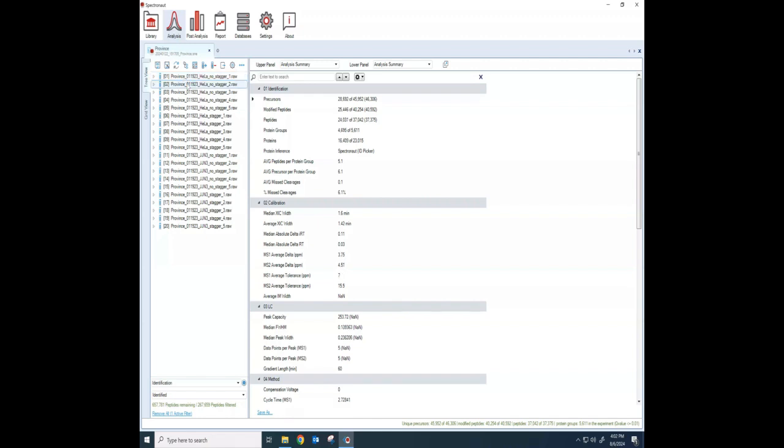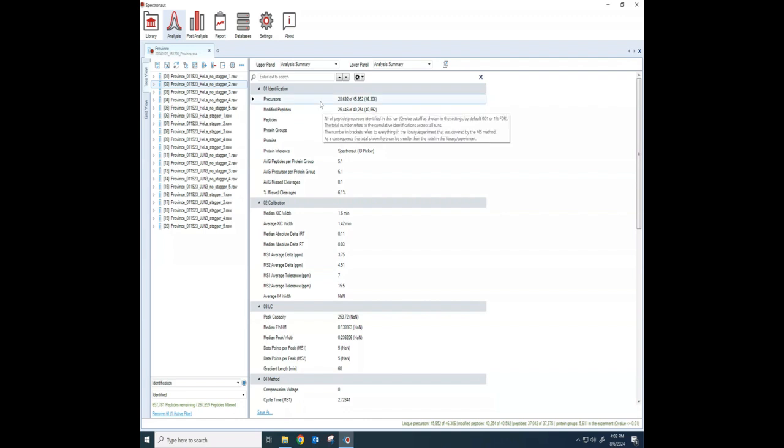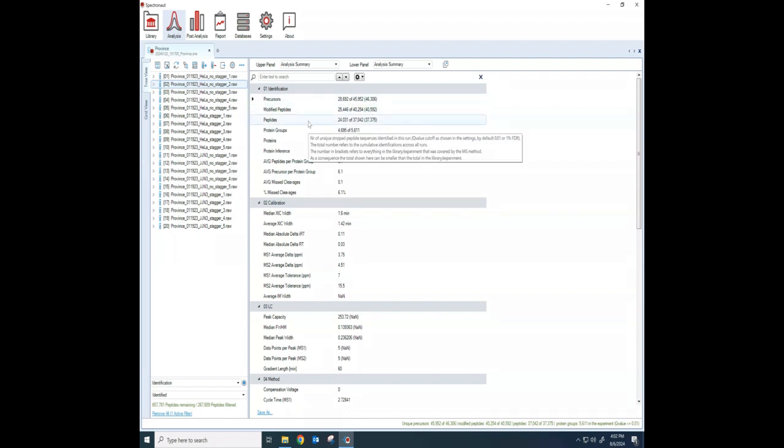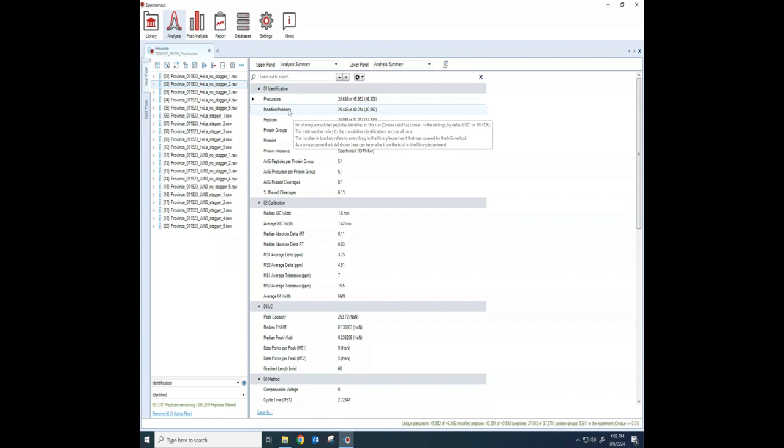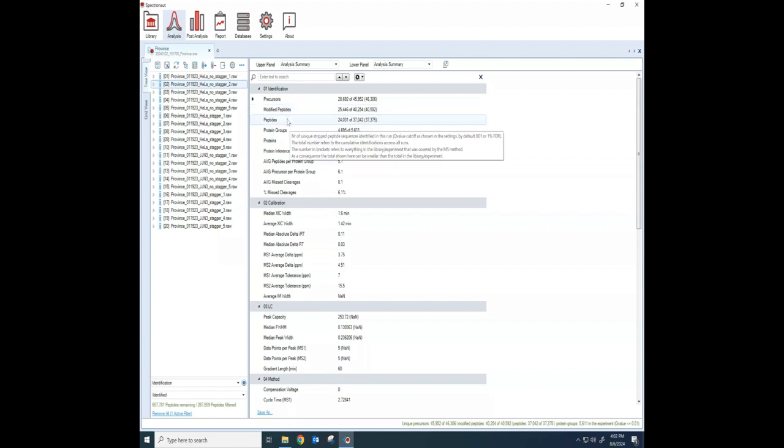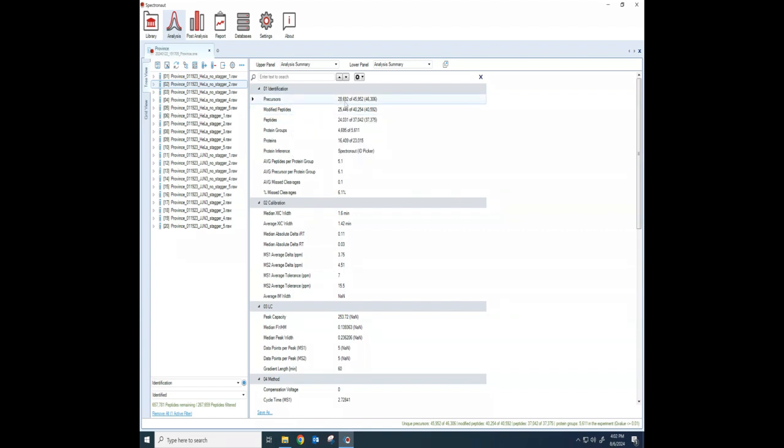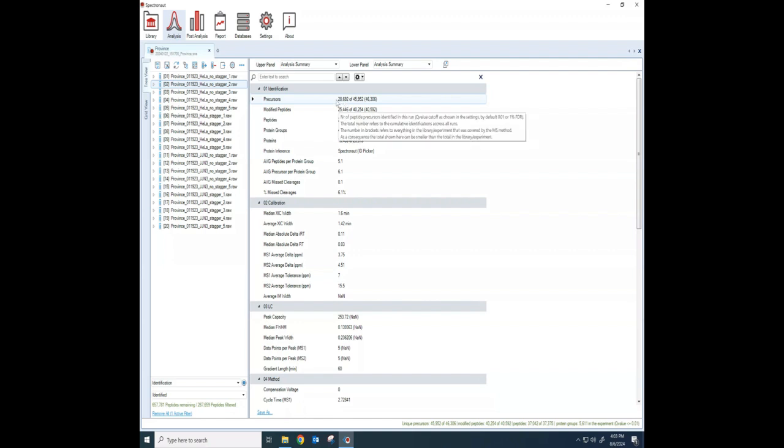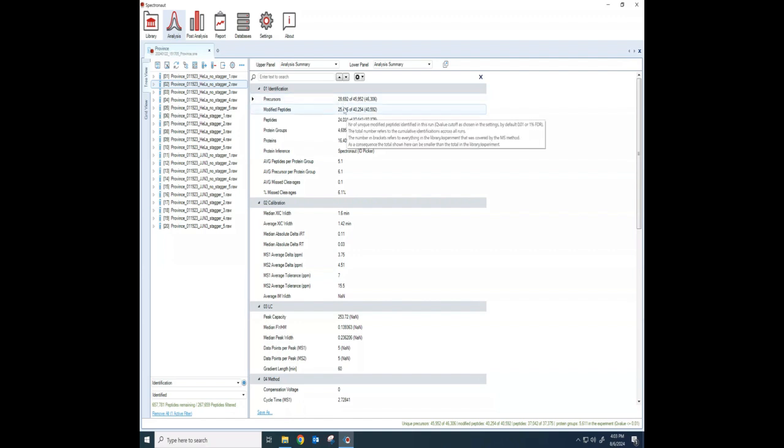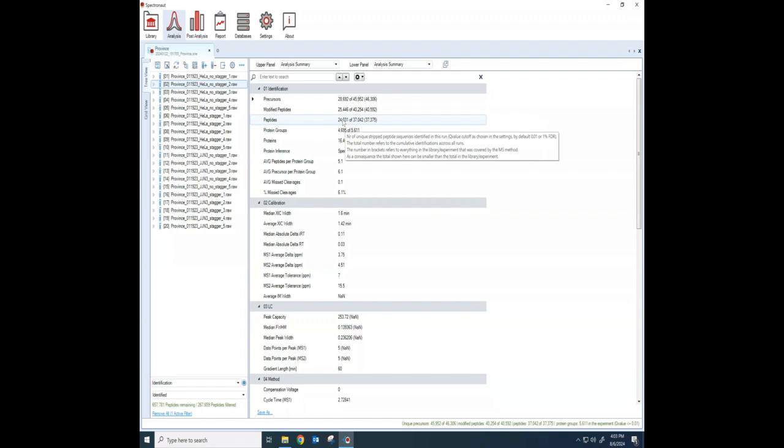This particular set of data is just some HeLa samples that I had versus some JJN3. They're two different cancer cell lines, and because they're different types of cells, there's going to be lots of different proteins expressed here. So you can see the number of precursors, and if you're curious about words like precursors and the difference between modified peptides and peptides, Biognosis has done a really good job in their Spectronaut software to have little pop-ups that give you information.